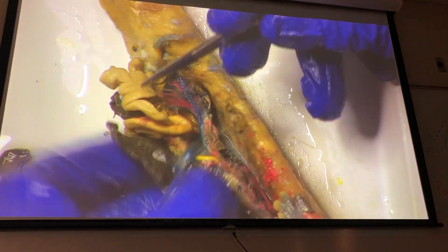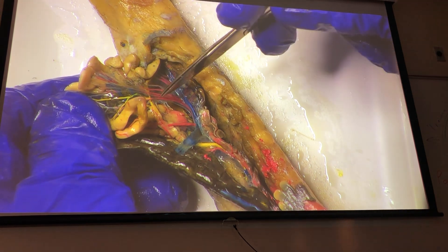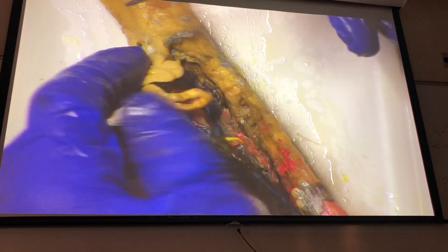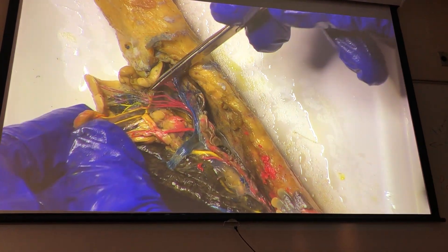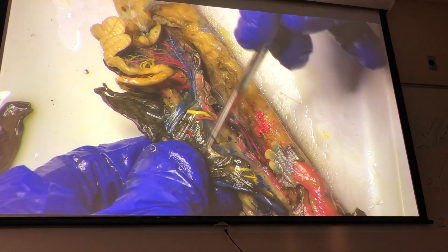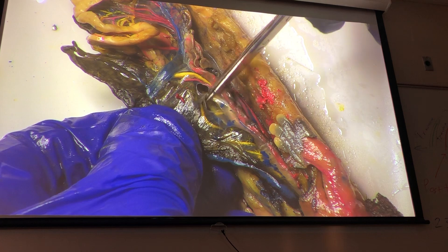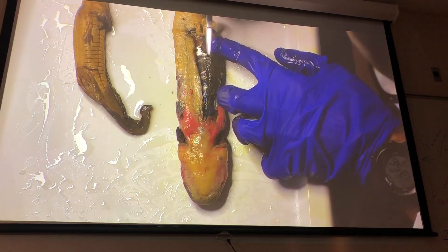Here we have the small intestine. All these little arteries leading into the small intestine are called mesenterics, and they branch into smaller vessels called intestinals. In the case of the vein, we have one mesenteric vein and a number of intestinals coming off of it. Here we can see the big post-cava. And here we see our nice yellow hepatic portal vein on the back side of the liver, right there.